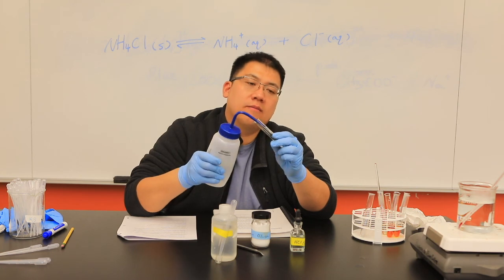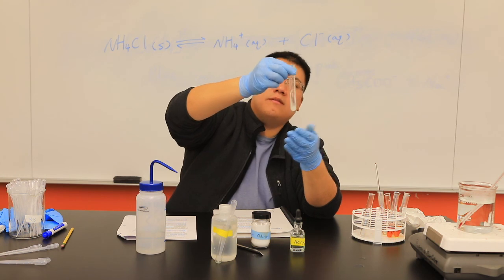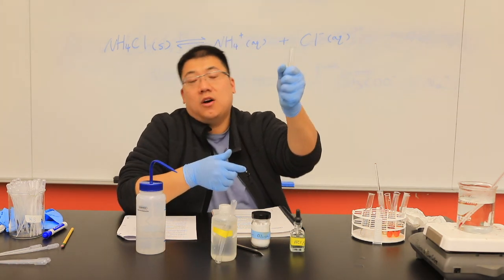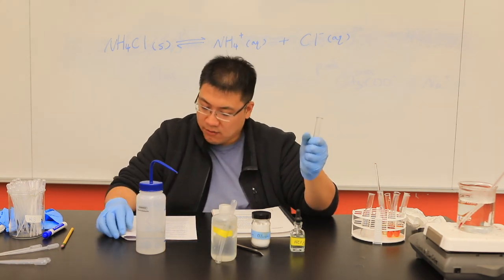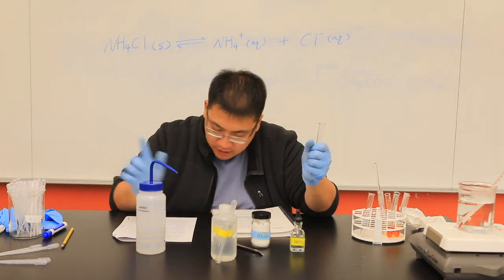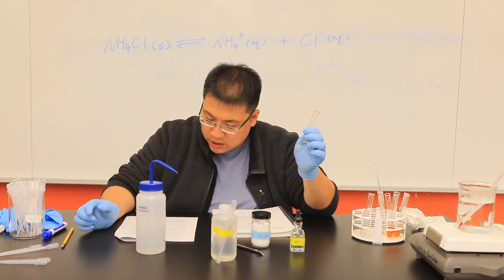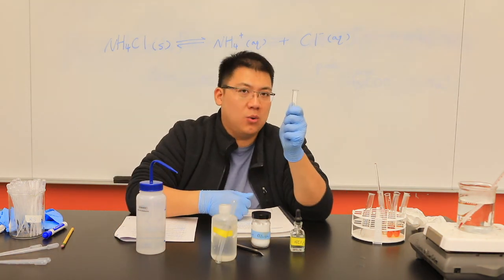Okay. So mix it a little bit. Let it dissolve. It feels cold. Therefore, is this an endothermic reaction or exothermic reaction? So record this into line 27 in your data sheet and answer the question of number 28, endothermic or exothermic. It feels cold. Okay?